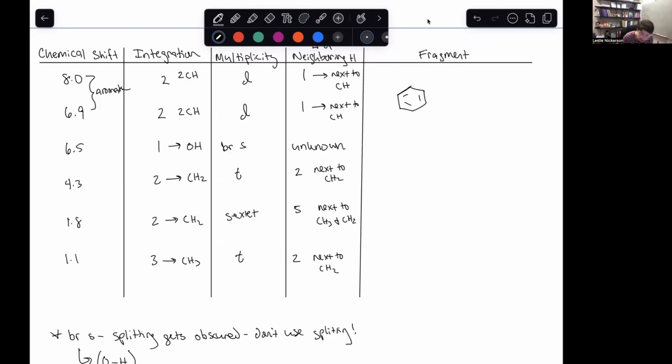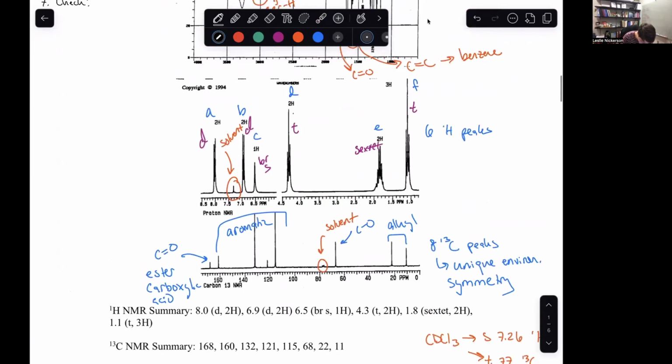But I'm immediately starting with that. And what we're looking for is what is the substitution pattern on this benzene that will give us 2 doublets that integrate to 2. Okay. And that's what we want to be looking at. So if you're really familiar with your substitution patterns, whether the ortho, meta, para, that's kind of what we're looking at. Very importantly as well is looking at what the sum of that aromatic region is.